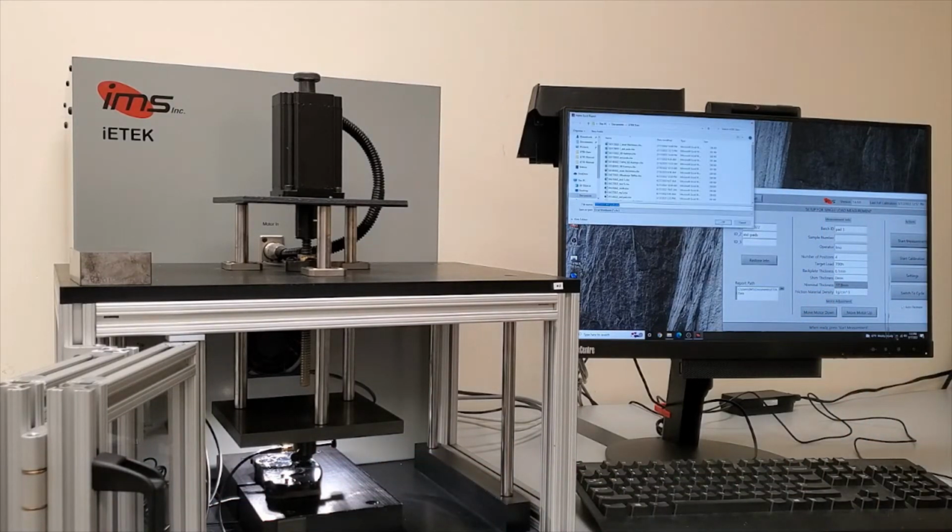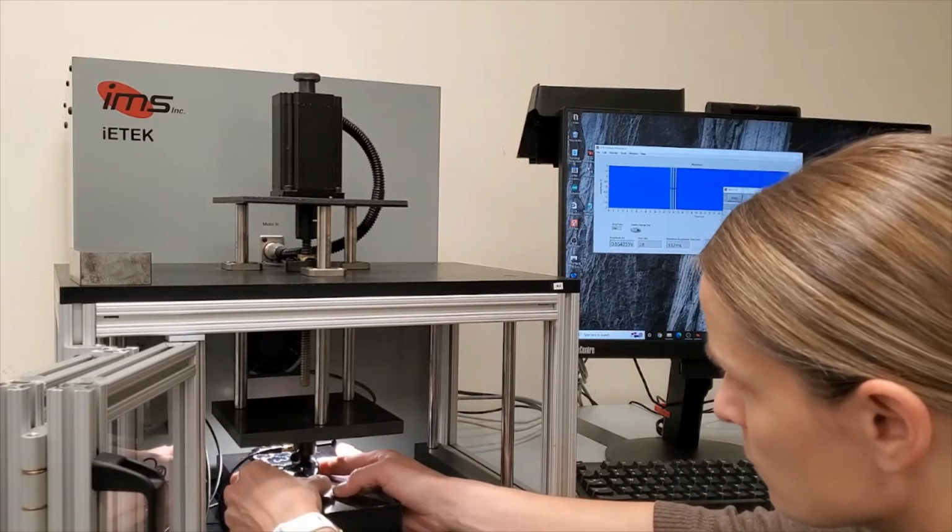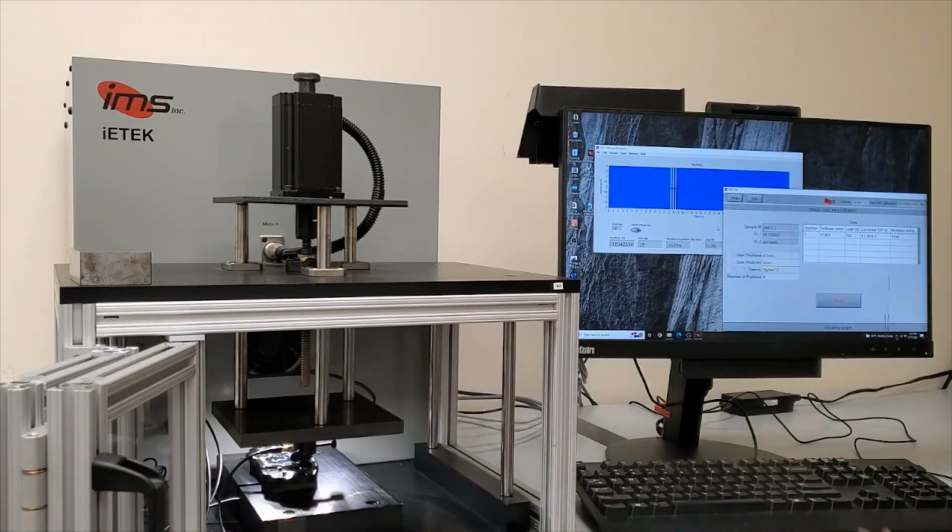the sample ID. When you make the first measurement, the dialog box comes up, which shows you where the report file will be. I'll have some close-up of the user interface so you can actually be able to read on the screen.